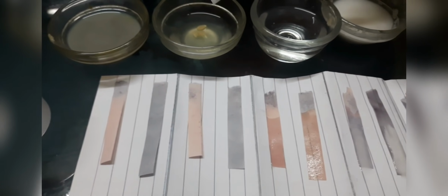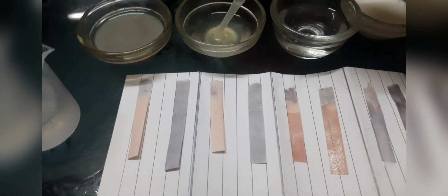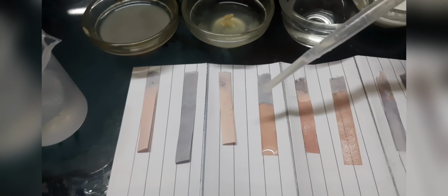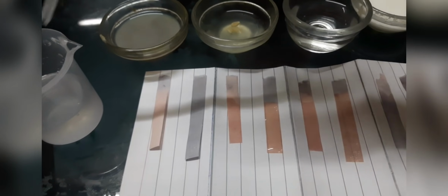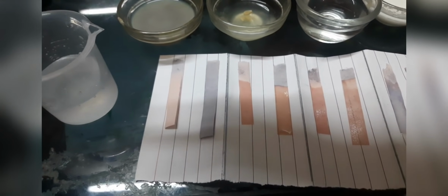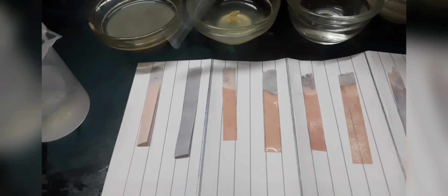Now this is lemon juice. So take some lemon juice. Drop it on the blue litmus. Drop it on the red litmus. I think you already got the answer. Let's wash the dropper, and let's start with the cleaner.